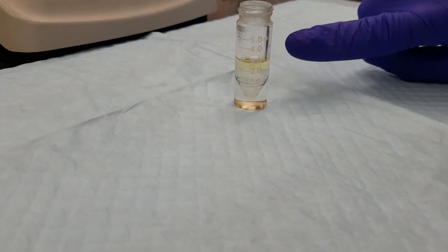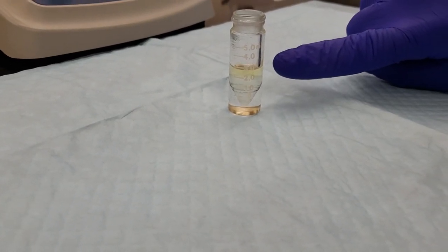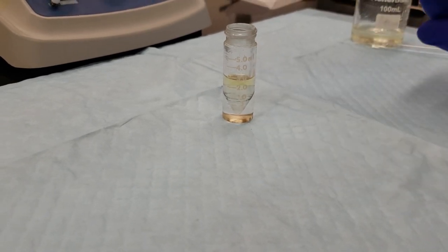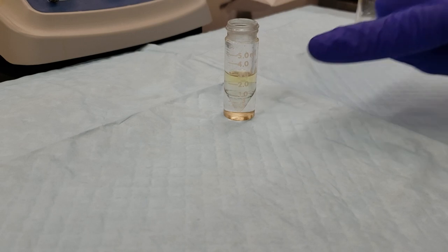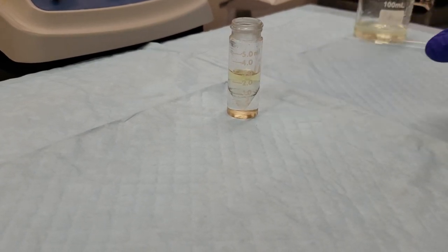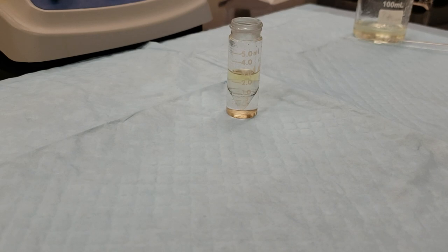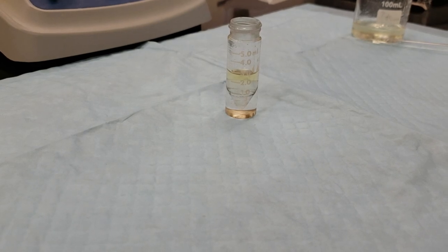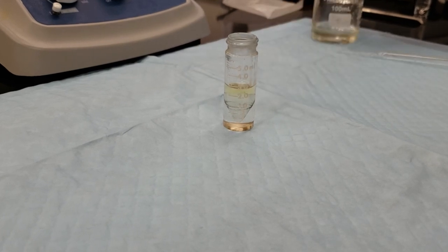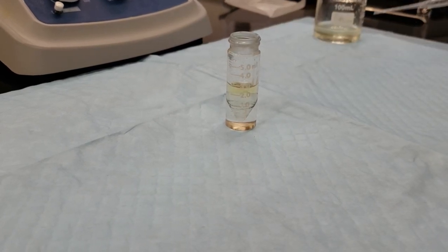Our alkyl halide layer, which is the top layer, is a pale yellow color. And then our aqueous layer, we can see the curve, almost a bubble-like appearance for the bottom layer of our aqueous solution. So I'm going to go ahead and keep removing aqueous and then discarding it into our catch flask here until we've just got our alkyl halide layer remaining.